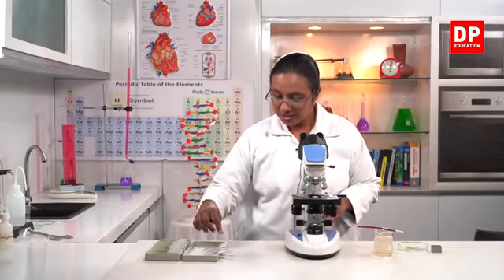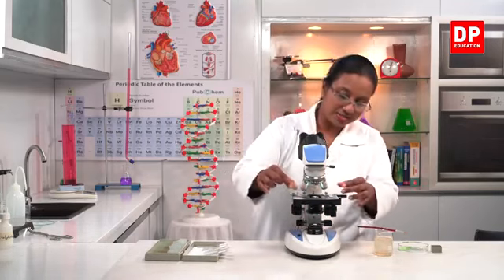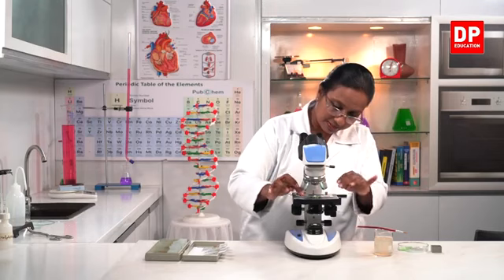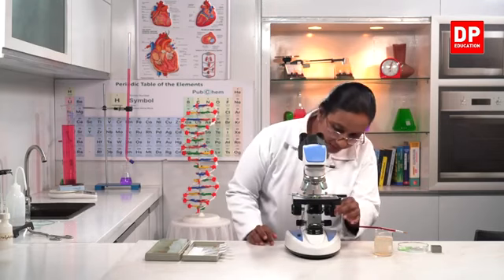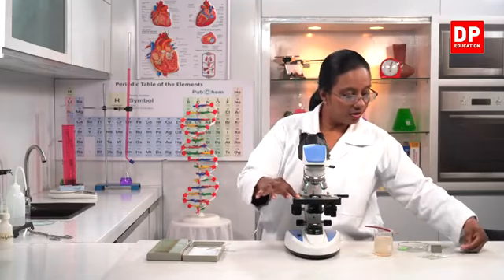Okay. So students, I have another slide, that is Chlamydomonas. That is also a unicellular organism. So if I place the permanent slide here, I am sure you all have observed this before also in your previous grades. But again, when we observe through the low power, you can see the unicellular structure, the green color cells, unicellular organism Chlamydomonas. Can you all see it clearly? Yes, it's very clearly visible. So these are all the unicellular organisms.